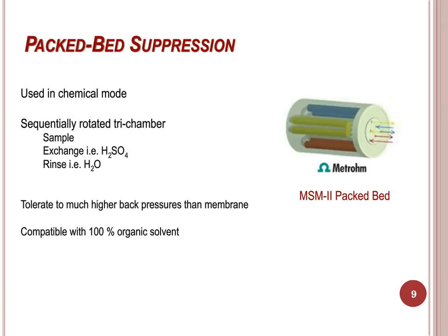An advantage of this suppressor is it's compatible with 100% organic solvent and tolerant to much higher back pressures than membrane-based devices.